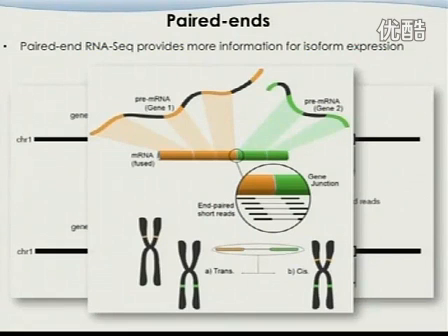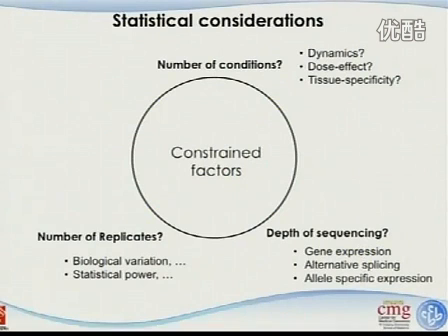So if you want to identify gene fusion, you can pretty much forget about using single end because it's just too difficult and the reads are too short to do that, although there are some studies doing that as well. For paired end, it will be much, much easier. You can see one end is on this part of the chromosome and the other end on that part of the chromosome, and if you observe that a lot, it suggests that you are observing a paired-end gene fusion event.